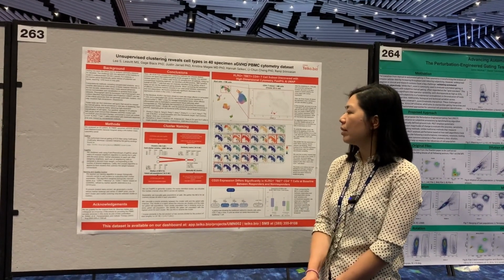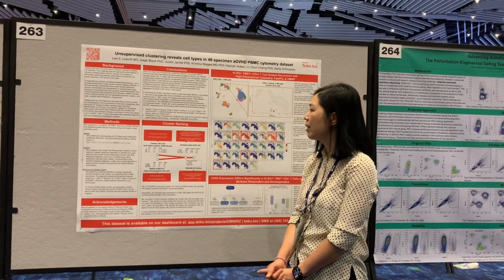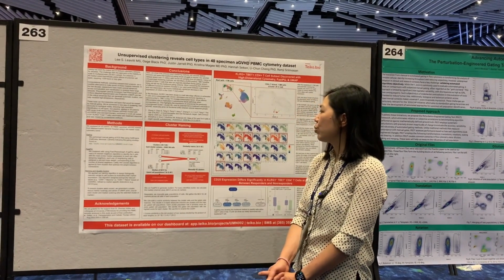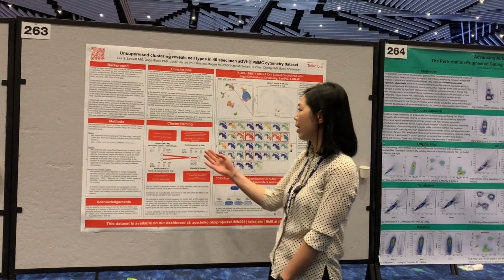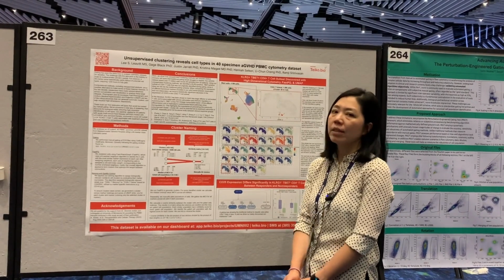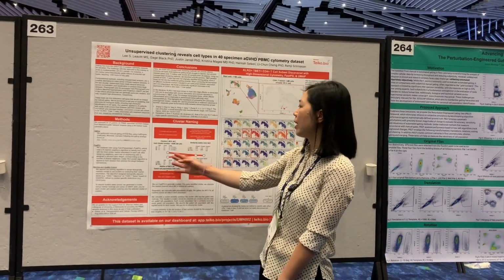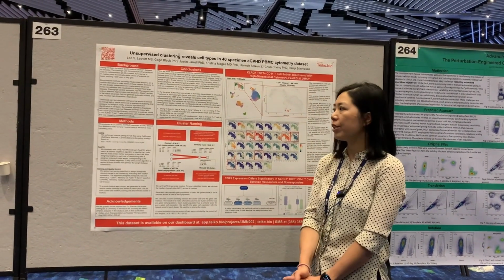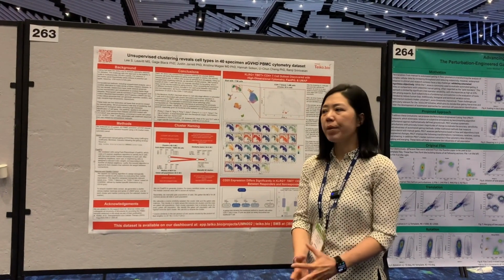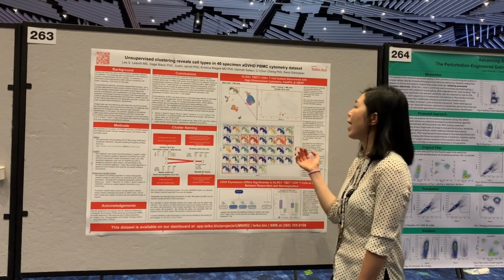With this method, we were able to identify 48 clusters from this dataset. Using the cluster naming algorithm, we matched them using a similarity matrix to name each cluster with the best knowledge that we have using gating. When we match the 48 clusters with our 36 gated populations, some of the populations may be overlapping or partially overlapping. Then we evaluate the expression pattern.